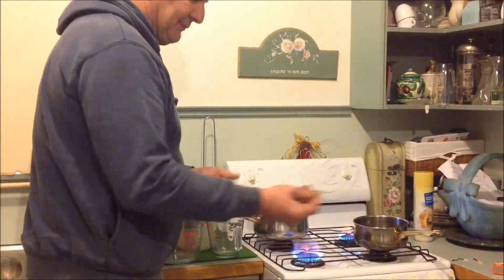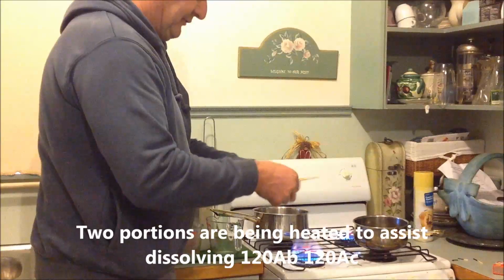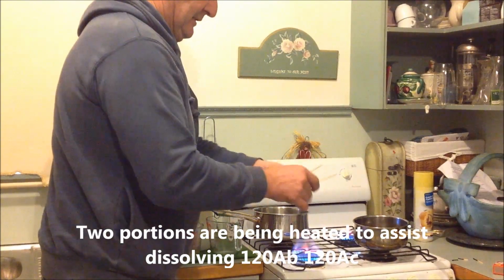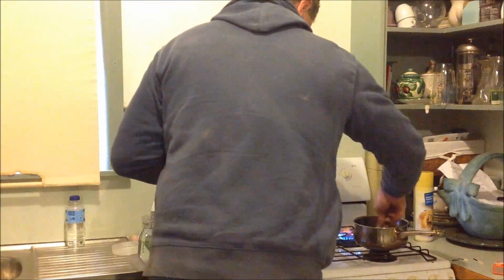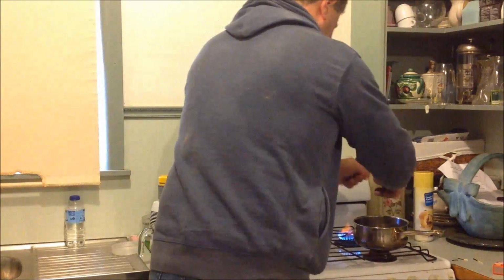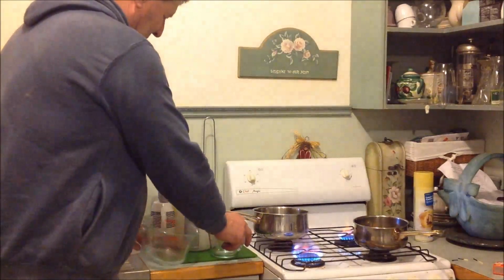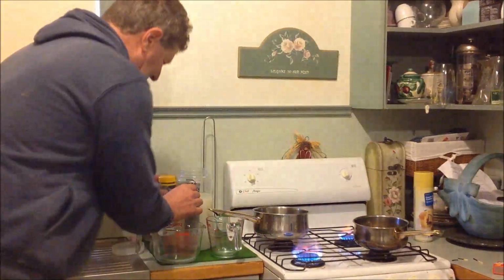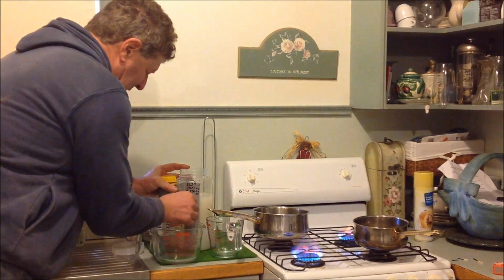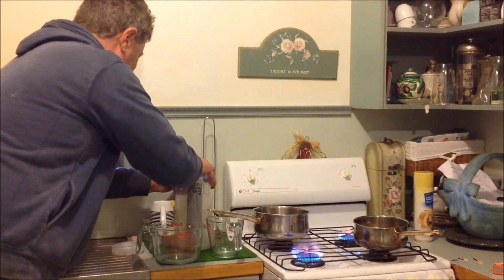So the way to do this is to put something in the bottom of a saucepan. I haven't got two of those, so I'm just going to use a skewer. Put that in the bottom of that one. A few more bits. Now that's just so that you don't get direct heat on the bottom. You don't want to break your dish, so I'm using a Pyrex dish. I've pre-boiled some water. So what I'll do now is I'll just quickly take my little piggyback off here because it's full of sodium hydroxide, which I didn't get to use.